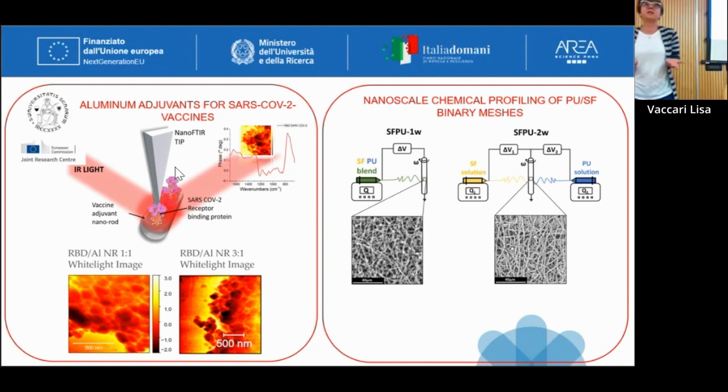Obviously, we do not have the sensitivity of X-ray diffraction or TEM, because I cannot tell you exactly which part is misfolding; my information is general. But it is information that I can achieve essentially in the real condition and on the real pieces. You cannot do the same with TEM or NMR or X-ray crystallography.